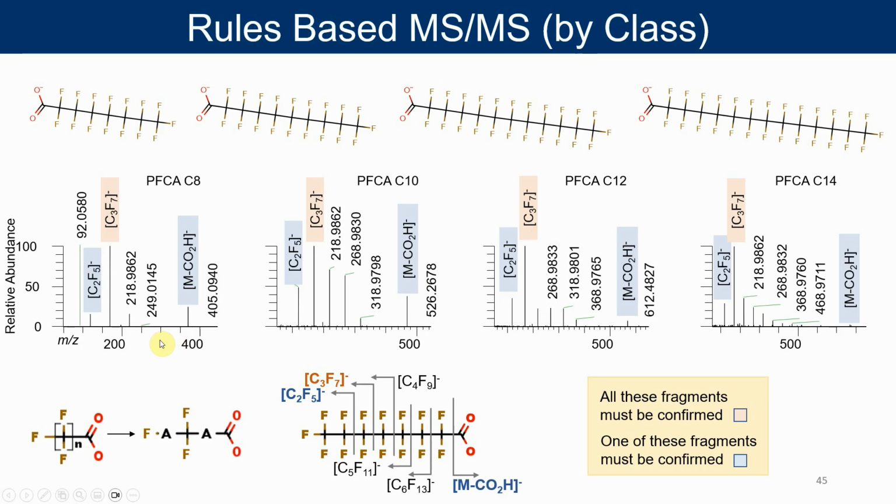One more thing I want to note here is that obviously at the beginning of mass spectrometry, everything was hand annotated. Actually, the spectrum would be printed on a piece of paper, and you'd have to write down the mass, you'd have to figure out what that mass might be. Now with computer-assisted MSMS matching, there's a couple ways we can do that. One is fragment screening, like we mentioned. We can look for fragments and have a list. For example, in our software, we have over 777 fragments that we know what they probably are, and we can screen against them, and then automatically name those fragments.